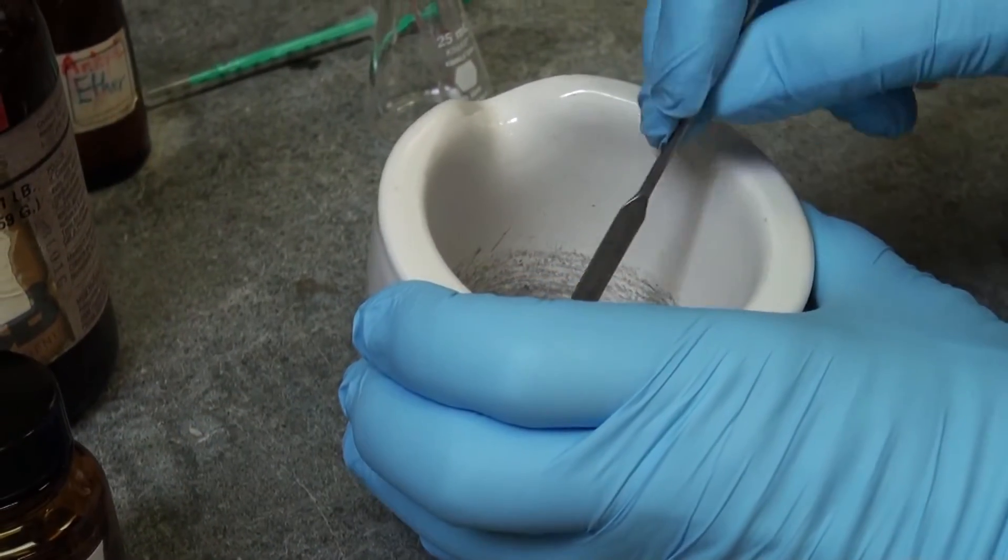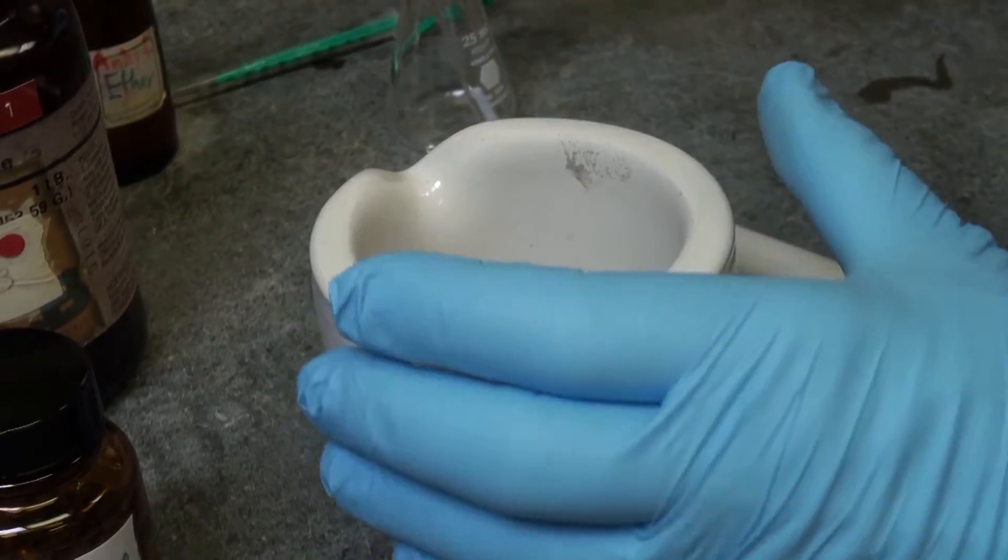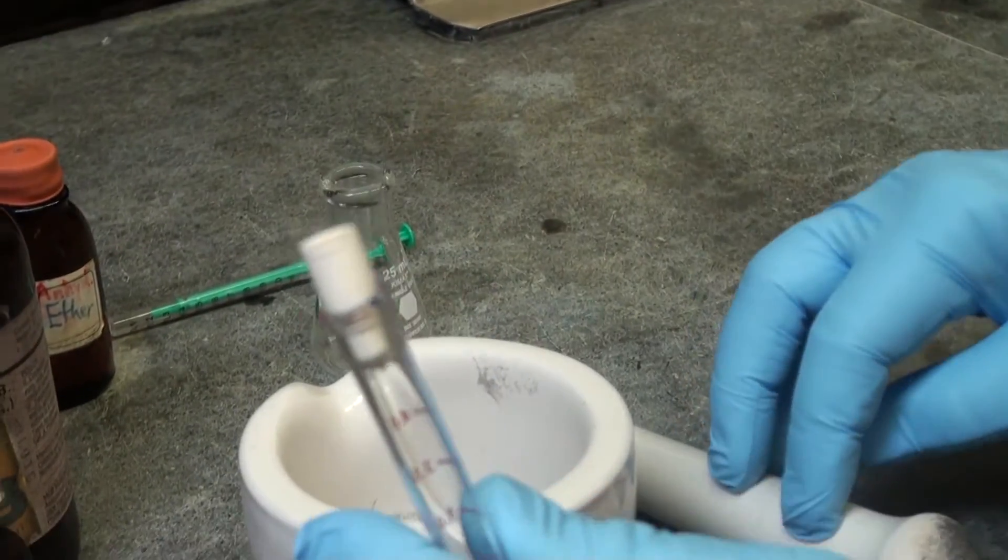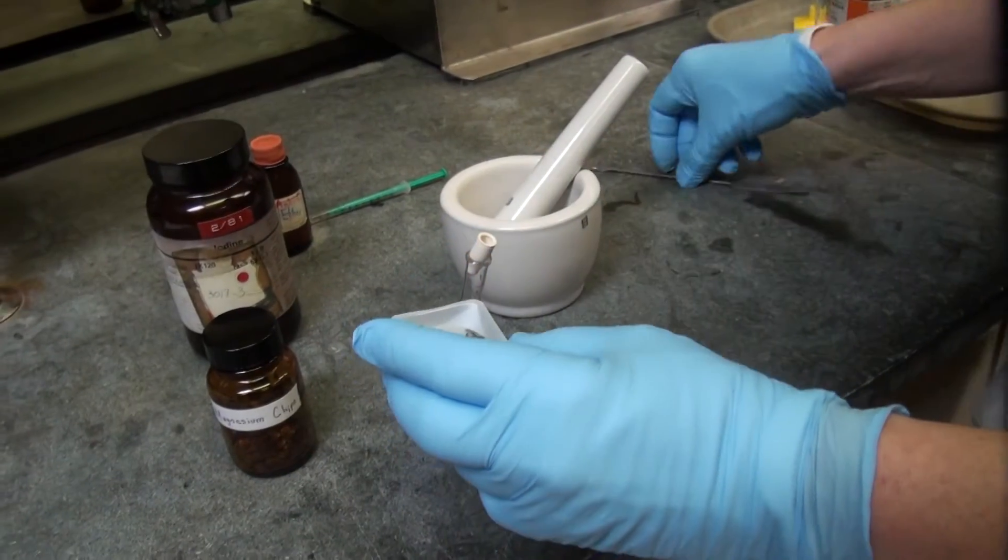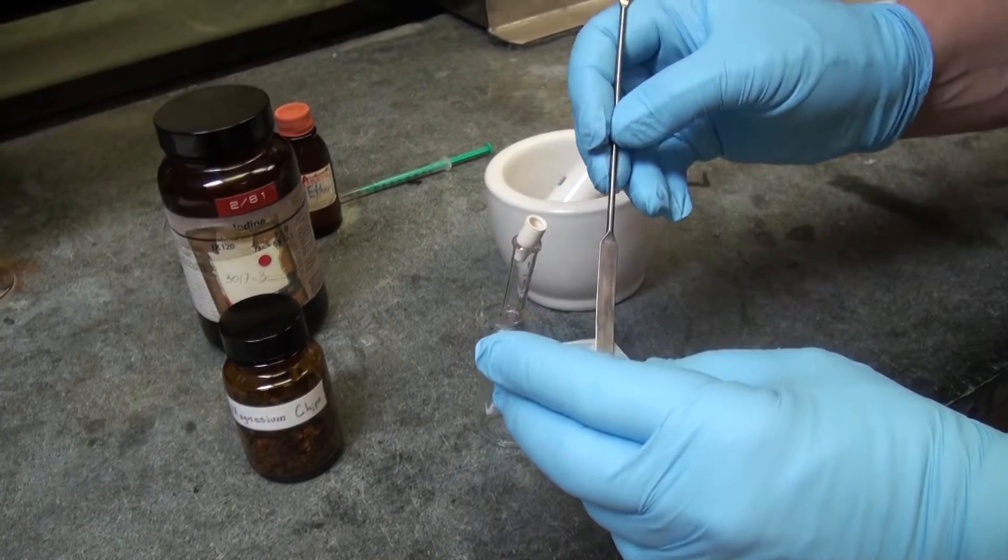Take the amount you have to take, weigh it with a weighing boat and put it in your reaction tube, which is now room temperature. Try to use the smaller pieces of the magnesium so that you have a bigger surface area.